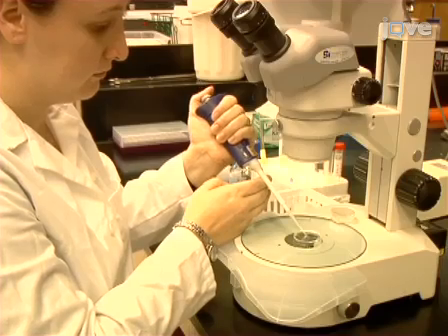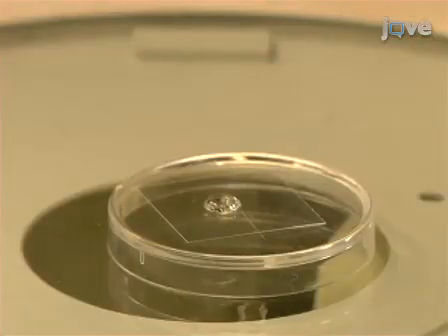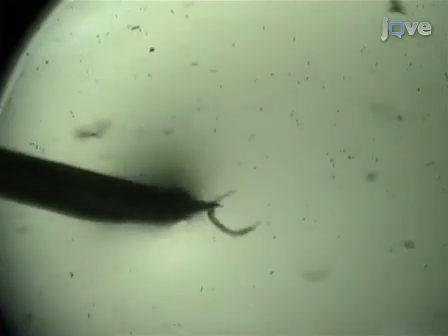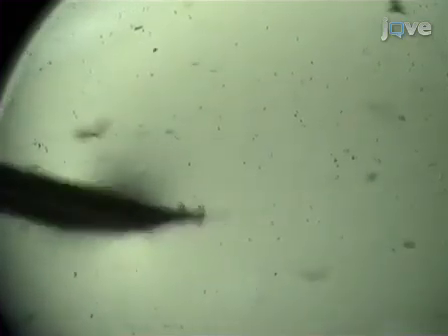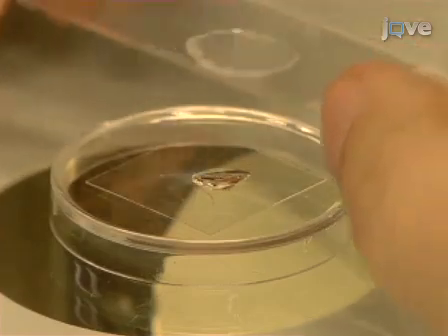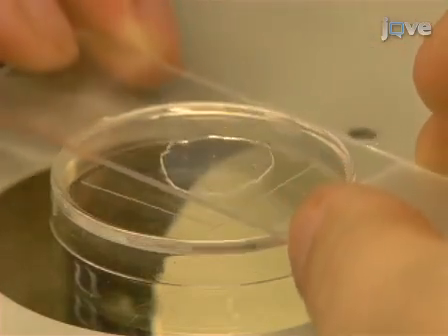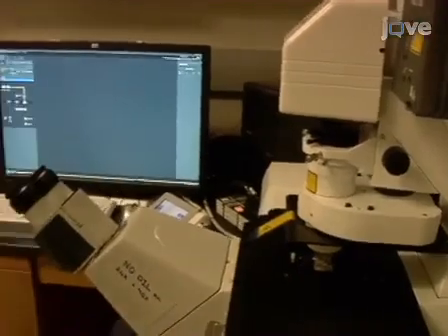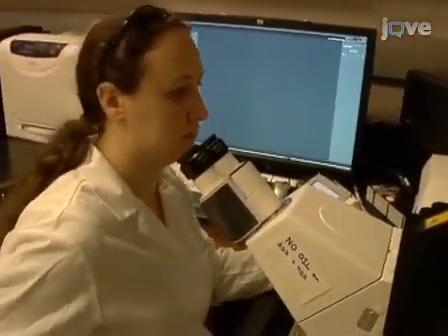Now, drop 20 microliters of egg buffer onto the center of a cover glass and transfer the injected worms into the buffer. Under a dissecting microscope, cut the worms open near the vulva using a 26-gauge hypodermic needle. The embryos will spill out of the worm. Now remove the top slide of the imaging slide and lower the agarose pad upside down onto the cover glass with the embryos. If the embryos will be imaged over an extended period of time, seal the edges of the cover glass with petroleum jelly to prevent desiccation.